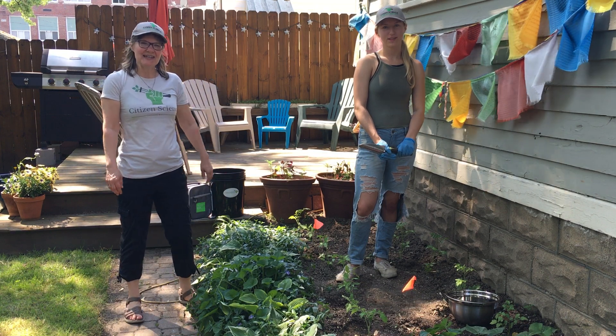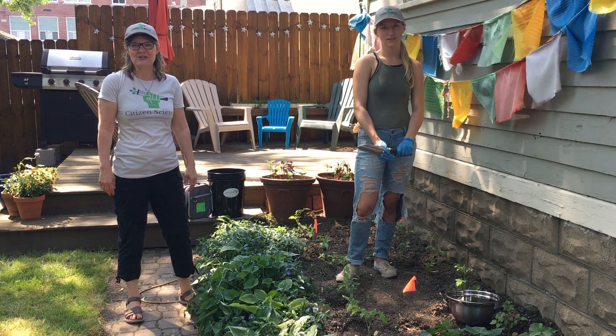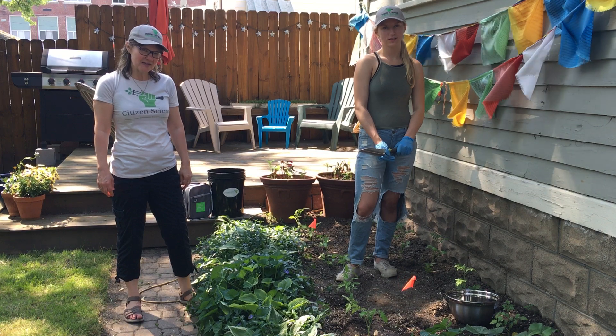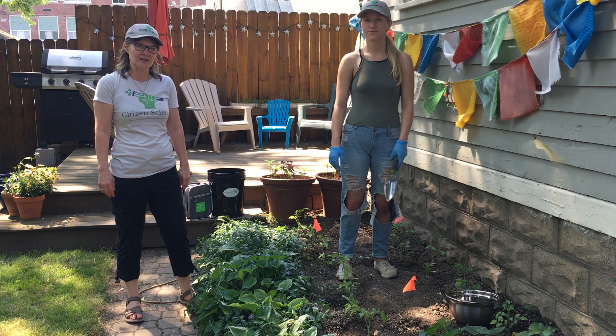Hi, my name is Jackie and I'm with Citizen Science Community Resources, and this is Krista with our organization as well. We're here to show you how to take a three-point random soil sample in a garden using our Citizen Science Soil Sampling Toolkit.